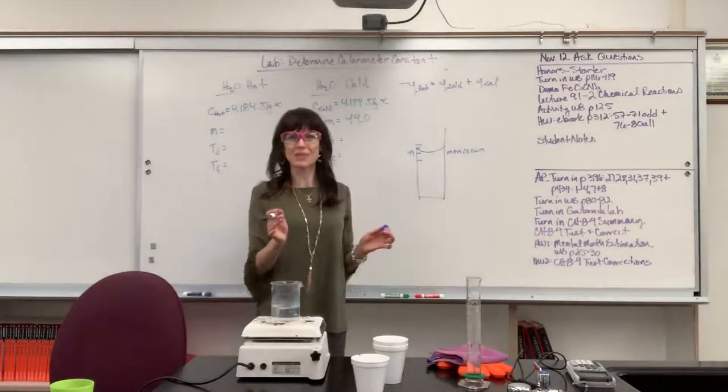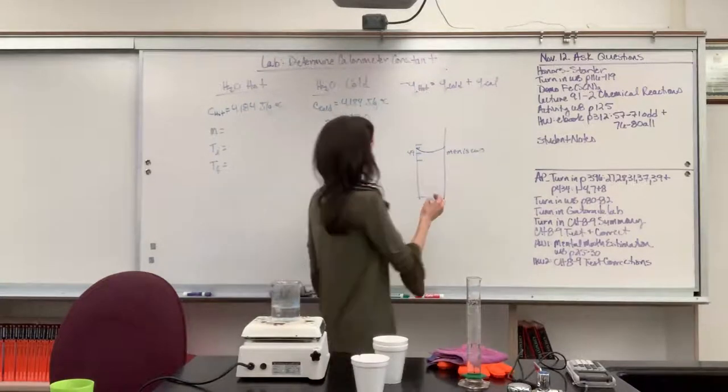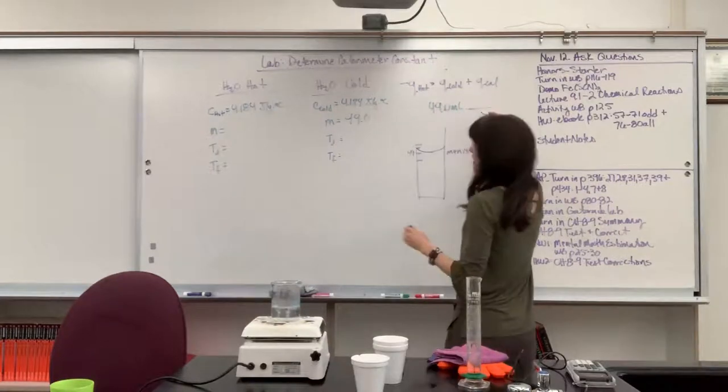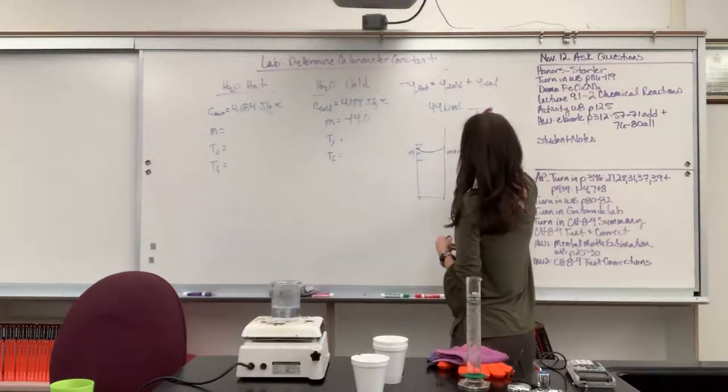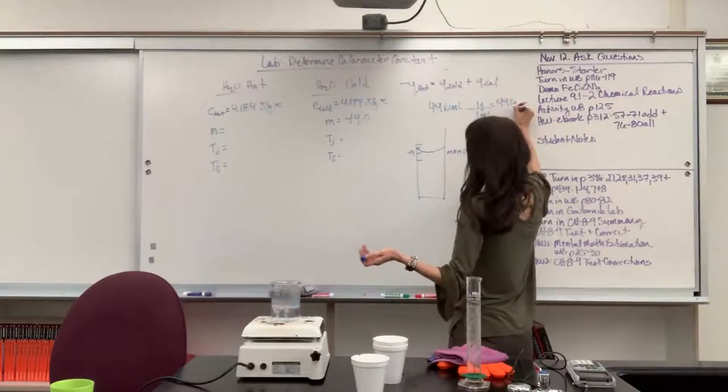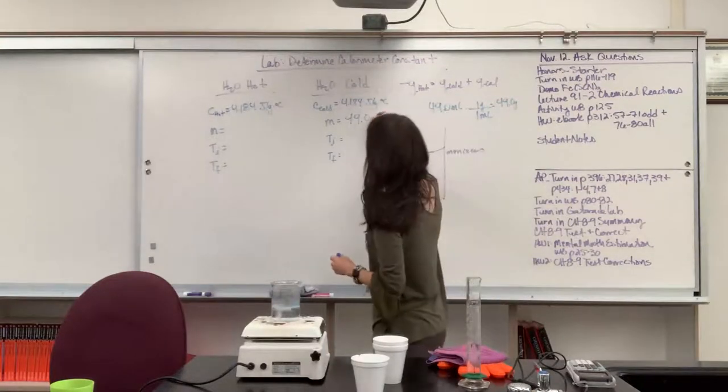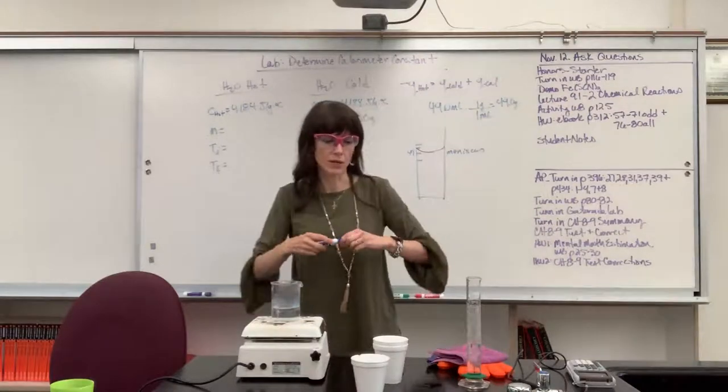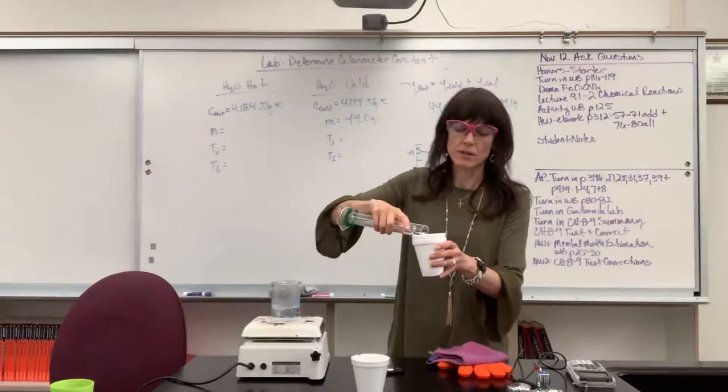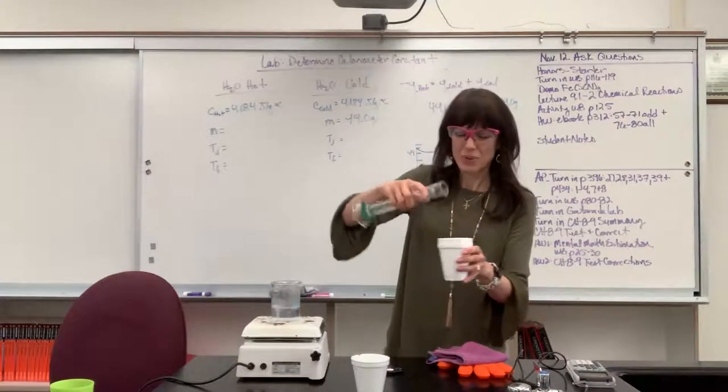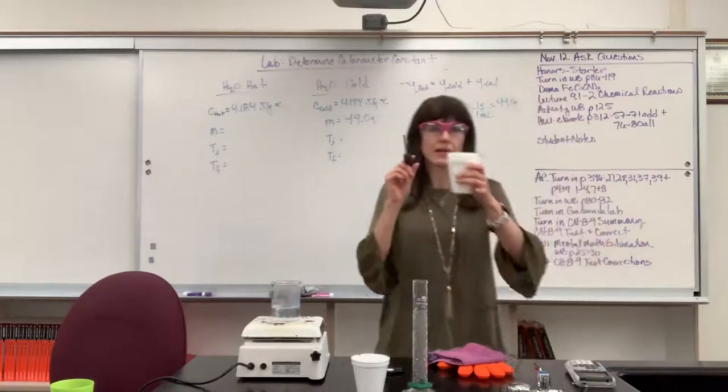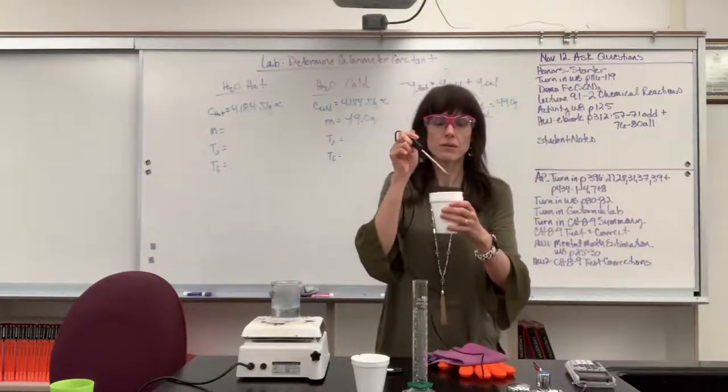Now remember, this is a trick we use in chemistry all the time. If I have 49 mils of water, the density of water is one mil for one gram. Which means I have 49 grams. Love that. We've got 49 grams of the cold water. So I'm going to pour this water, and this tap water is not truly cold. I'm going to pour this water into my calorimeter.